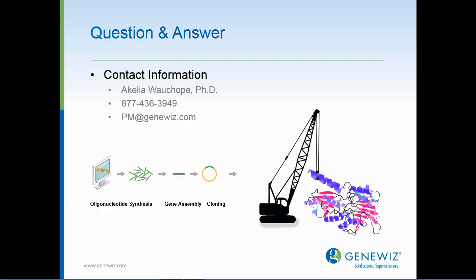Another good question. We do understand that in most cases, although it might seem redundant, we might actually need to resynthesize the protein region that you currently have. However, before we can make such a judgment call or determination, we really need to look at the overall project scope, take a look at what materials are available, and then suggest our best recommendation to assist you in tagging your protein of interest.